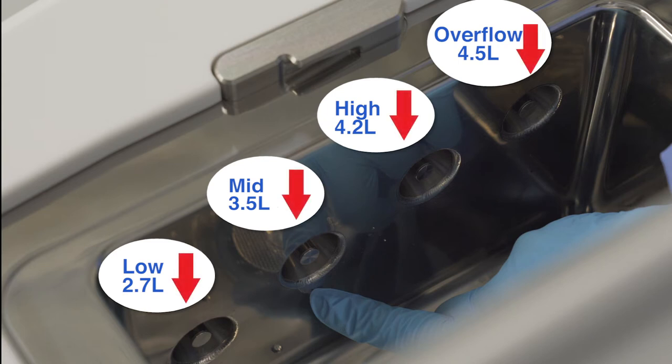The four level sensors located on the front wall are as follows: low is 2.7 liters, mid is 3.5 liters, high is 4.2 liters, and overflow sensor which is 4.5 liters.